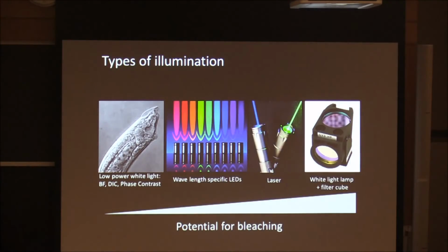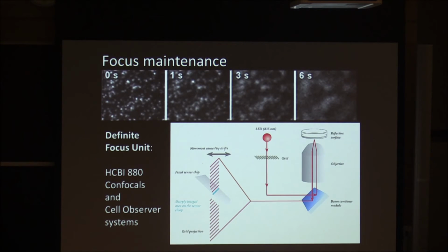So if you notice there's a focus drifting, and during your experiment you cannot do the autofocus, and then you just manually do it, is it still okay? It's still okay. When this is working well, it's better. It's faster. It usually does it a little more often than you sitting there doing it yourself.